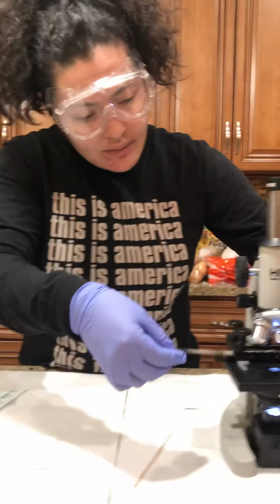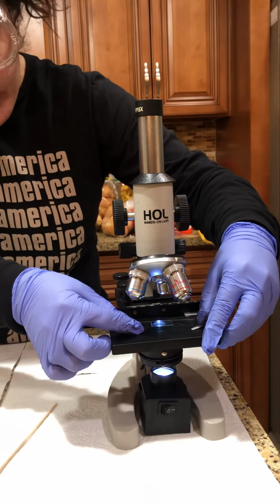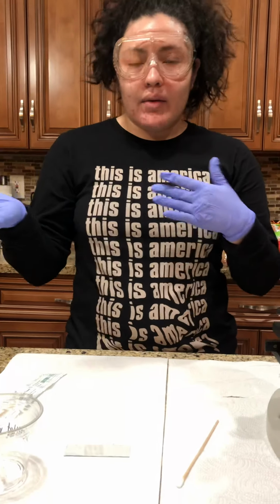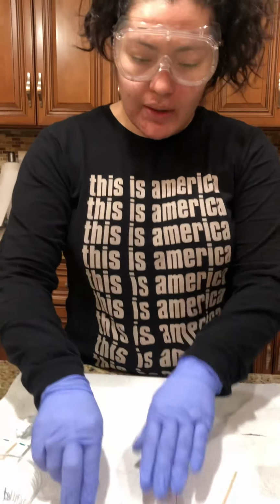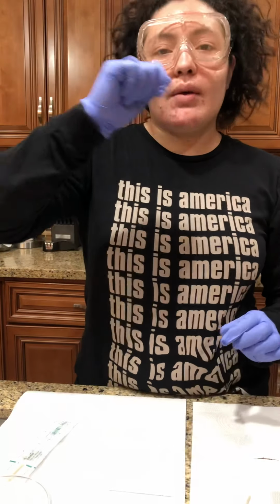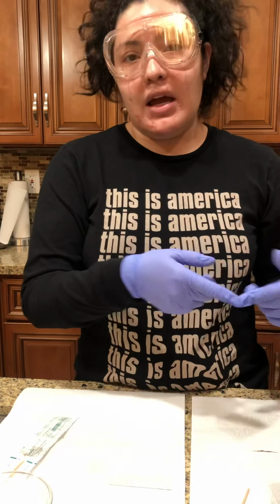So now I'm going to put this in right here and evaluate, see what I see with my microscope, okay? And then I'll give my report on my lab report assistant. Also with part 2, I'm going to get another clean slide. I'm not going to show you how to do it, I'll just explain: I'll scrub my teeth and gums, do the same process as I did with the cheek, and evaluate what I see.